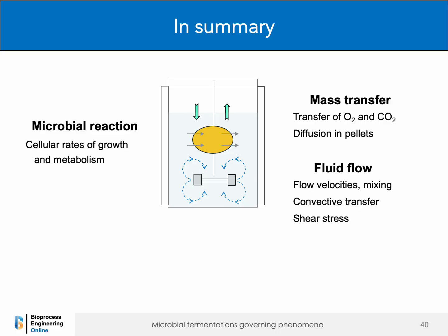In summary, in this tutorial you learned that in fermenters, the time-dependent variations in fermentation component concentrations are governed by three fundamental phenomena: microbial reaction, mass transfer, and fluid flow. The primary driver of fermentation dynamics is the microbial reaction, characterized by the rates at which cells consume substrates, grow and produce metabolites or recombinant proteins.